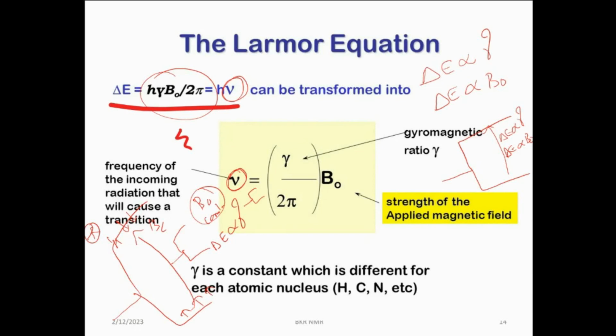That is known as relaxation. It releases energy, which will be recorded and detected, and then we study the NMR. Depending upon the relaxation, you will study a particular hydrogen.